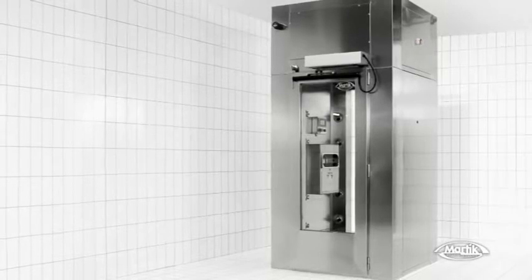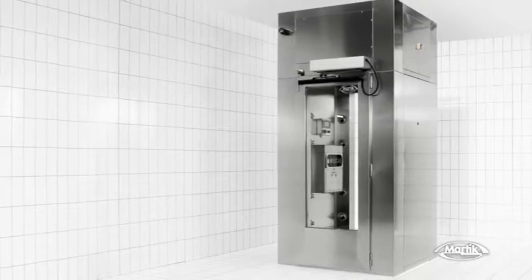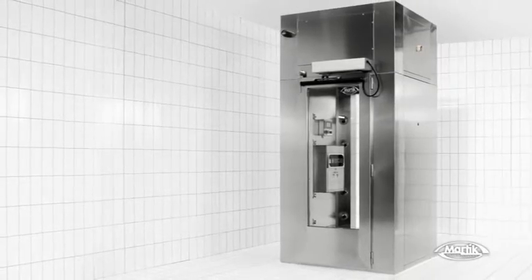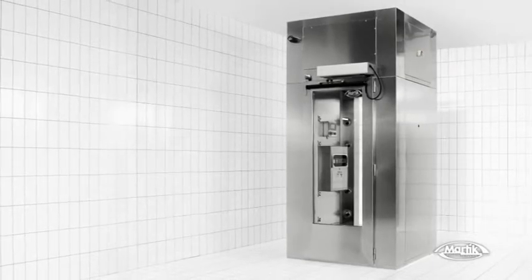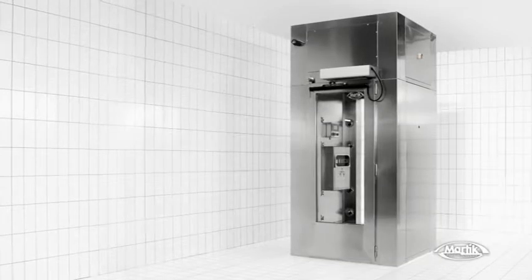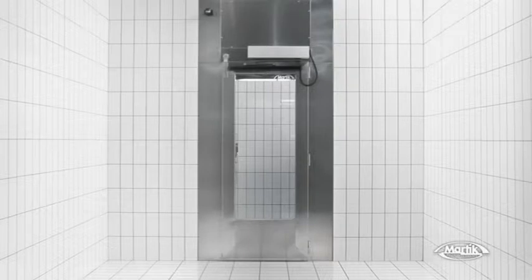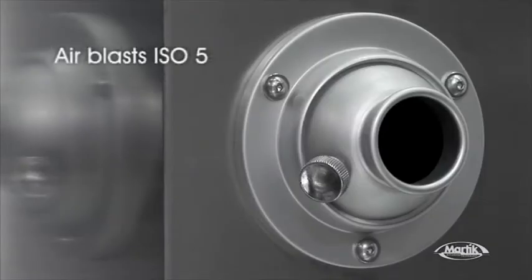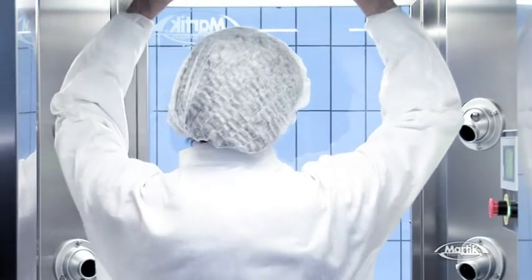Airtek is the air blast unit for the decontamination of all your staff. It's extremely versatile as it can be set up in any processing plant where it's vital to remove polluting particles and microorganisms before getting into clean rooms or dust-free divisions. Airtek is entirely built in stainless steel, complying with the current sanitary standards. The working principle is based on the action of high-speed air blasts to shake off both inert and active particles.